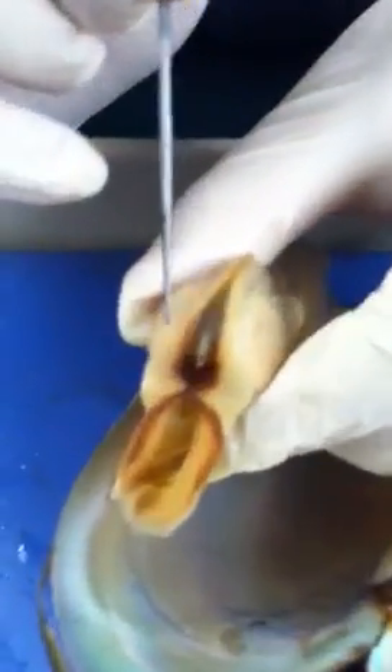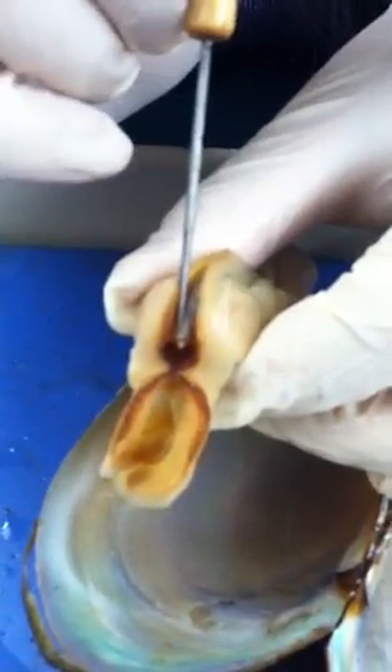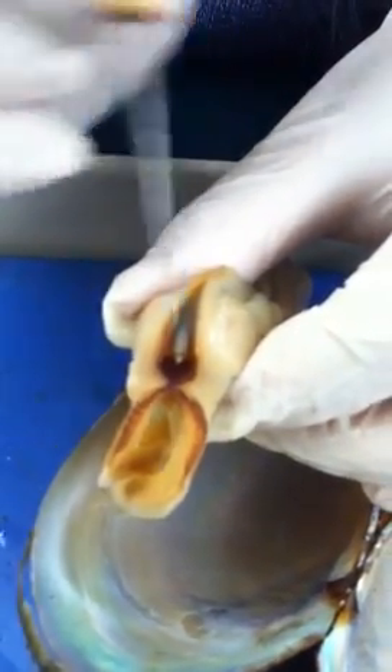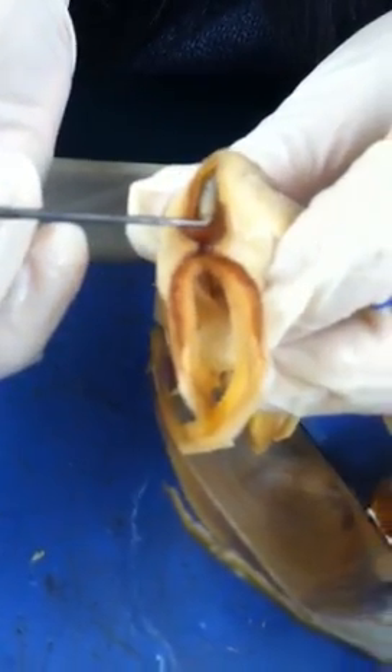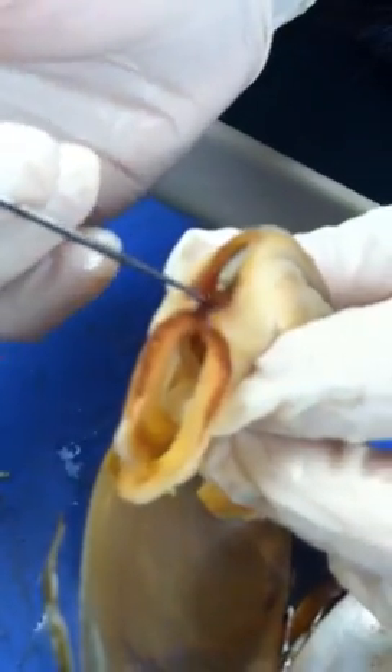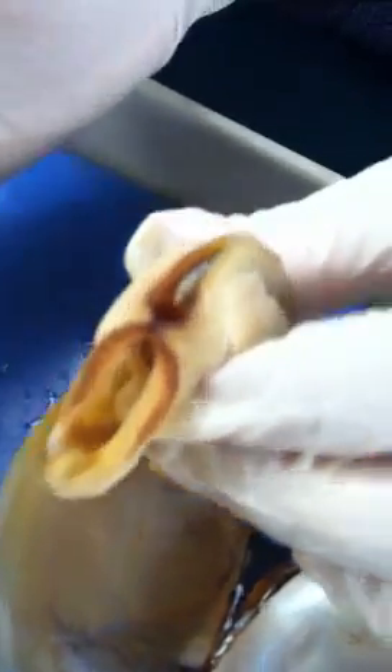In the excurrent siphon, you will see two more structures. The first one is the rectum, and at the end of the rectum, you will see an opening — that will be the anus. So that's the anus and the rectum, and that's it about the clam dissection.